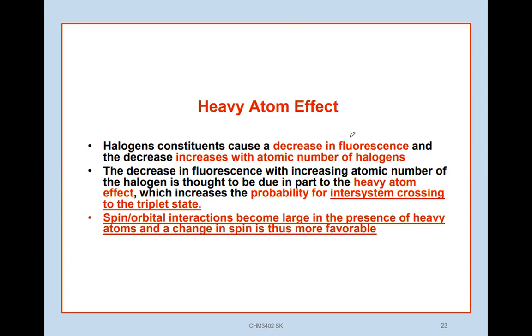So if you are to do quantitative analysis, you have to degas. If you have the sample, you have to purge with nitrogen to remove halogens as well as oxygen. Oxygen also interferes with the fluorescence intensity.